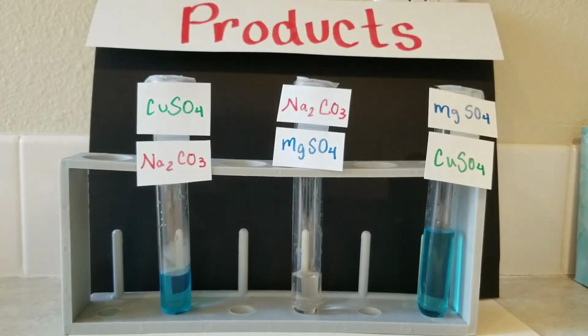The middle one, we've got some sodium carbonate there. We're going to add the magnesium sulfate. So we've got a clear liquid with another clear liquid being added together. So if we did end up with a color, that would be something new because we don't have any color to begin with.